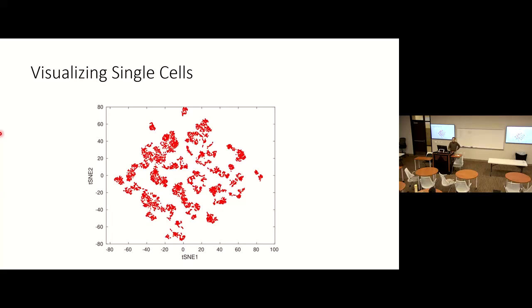Over the years, people found that the t-SNE method has been widely used and is suitable for single cell data analysis. t-SNE, the technique, was not developed for single cell data analysis alone. It was developed for other high dimensional data in the data science field. But then single cell people, when they had data, realized t-SNE gave you better visualization.